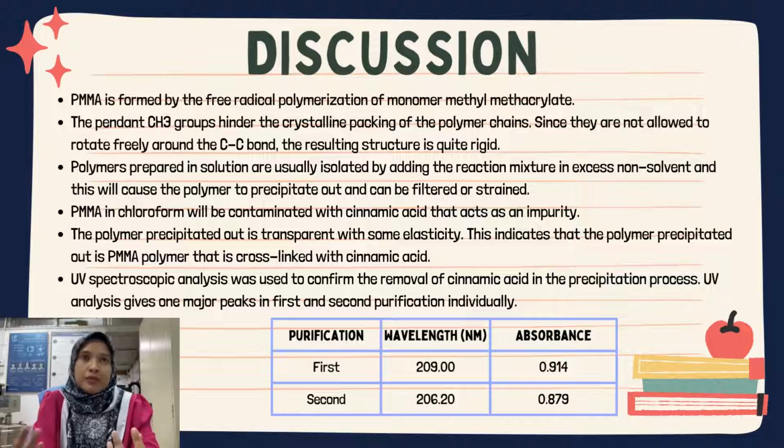The polymer can be removed by cooling the mixture with ice or by adding an electrolyte like sodium chloride or diluted acid solution. Other methods such as long stirring time, shaking, and centrifuging can also complete the separation. The stirring needs to be vigorous to prevent the polymer from sticking together.